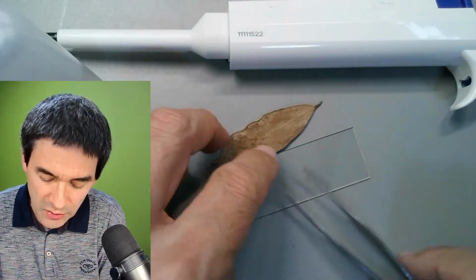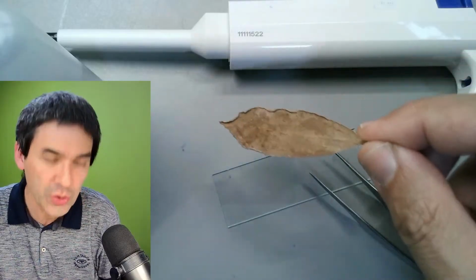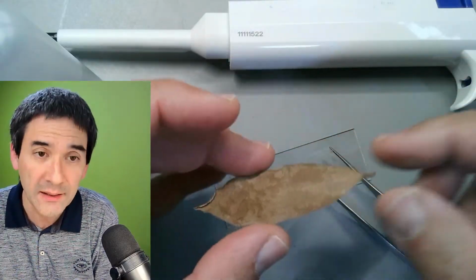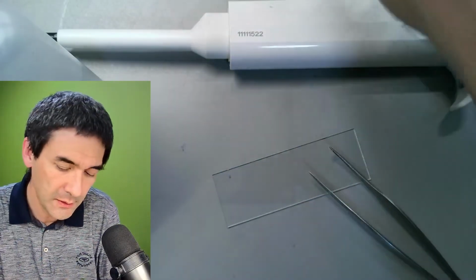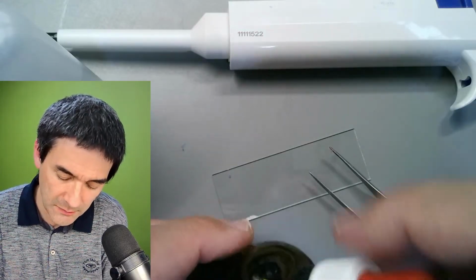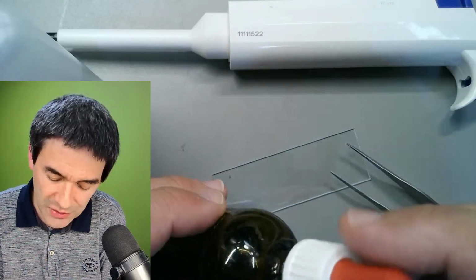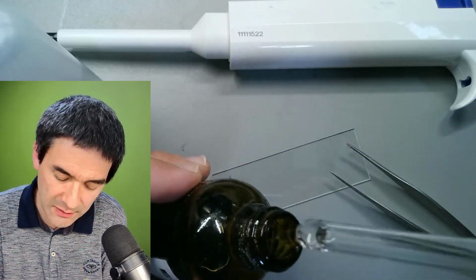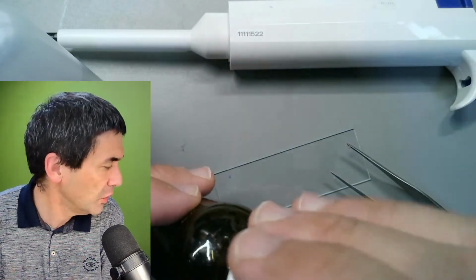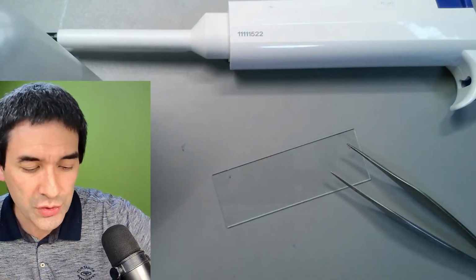And what I'm going to do now is, so not all leaves have those. Unfortunately, I don't know which plant they come from. Yeah, that's a little bit of a pity, but I'm going to use the glue now and we're going to simply look at those and enjoy what we see. Actually, you know what? I have to be honest with you. I need to do a preparation step here.